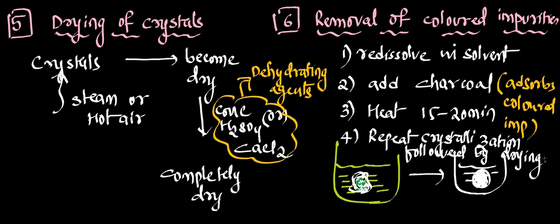So I hope you are clear with this technique. Simple crystallization, where heating will be there and also cooling will be there. When we do heating, it becomes saturated, and when we do cooling, the less soluble component starts crystallizing out.